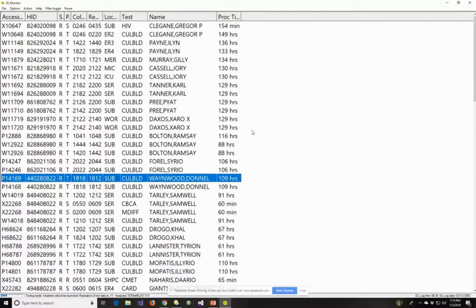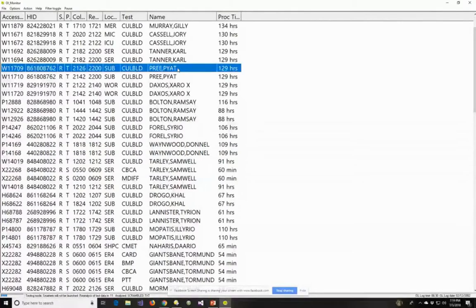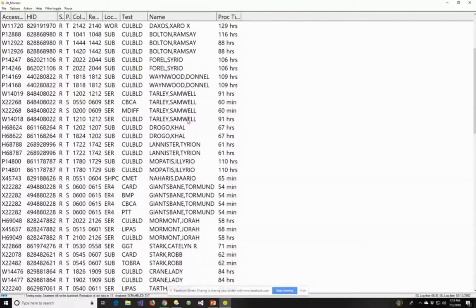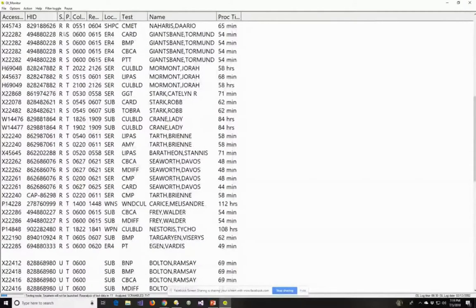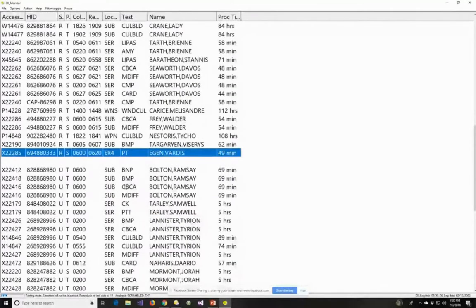We can change the font so it fills up the screen depending on what kind of display you're using. Look at the process time here — we're not sorting on this right now but we could sort on it. We've got blood cultures with unrealistic hours in this demo data. We've only got one sort employed — we're sorting according to status. We've got received tests and unreceived tests down below, broken up by a little line. The list is a couple of pages long, but it has an auto-scroll feature.